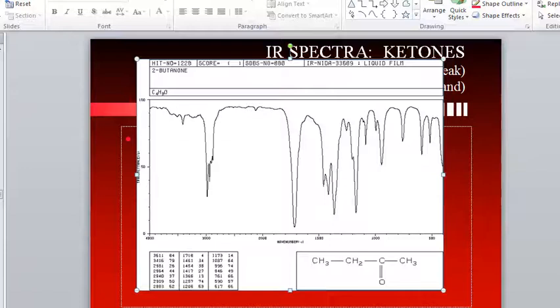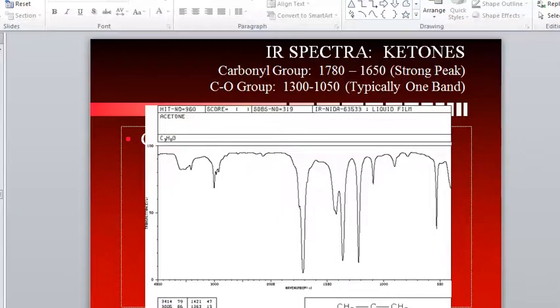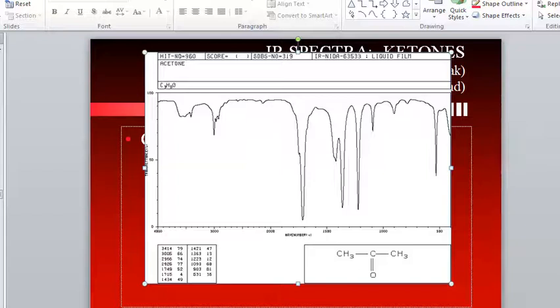Well, is that one important? Yes or no? It's tiny. Well, I'm not really sure. And ketones are harder to pick out because of that reason. So, if there was one that's important, I would label it as a ketone. But if both of them are important, then I would have to label it as an ester. And that's why I'm telling you to do both. Ester slash ketone.